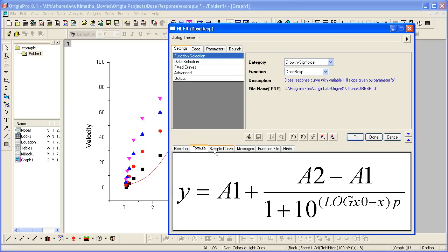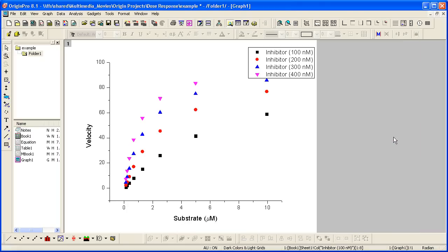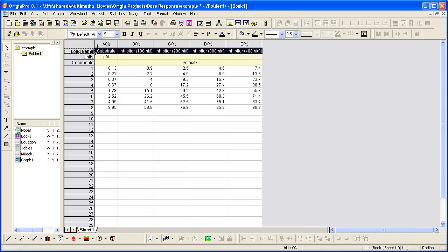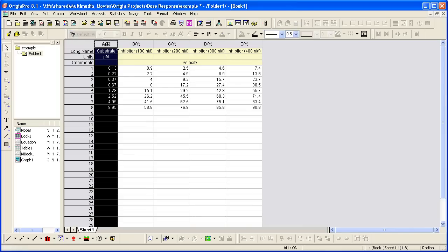Notice that the x-values, substrate, in the dose-response function are in logarithmic scale. So prior to fitting, actually I'm going to cancel this, we need to go back to the worksheet and transform the data.